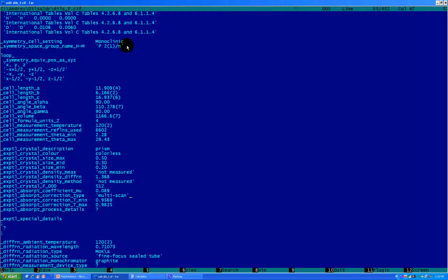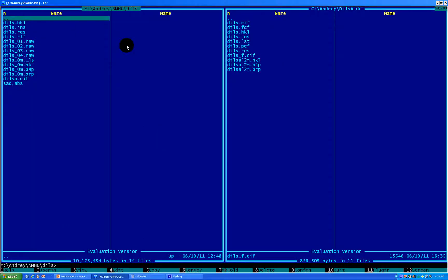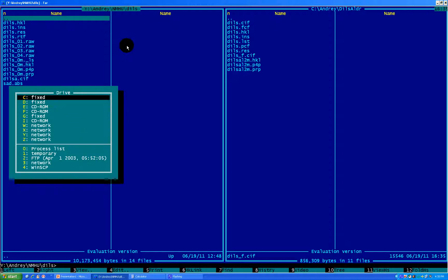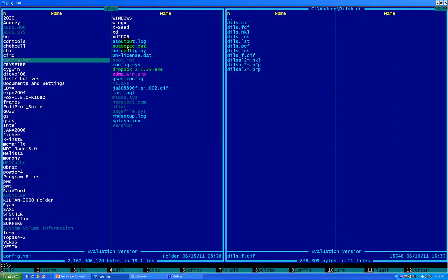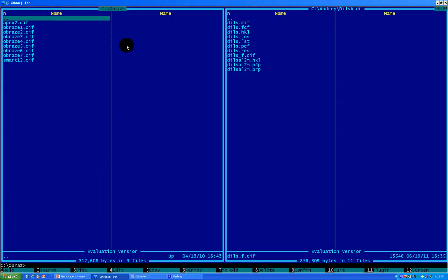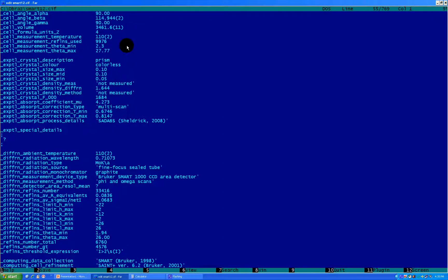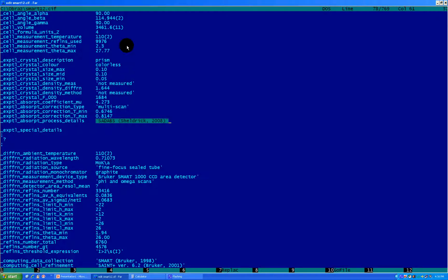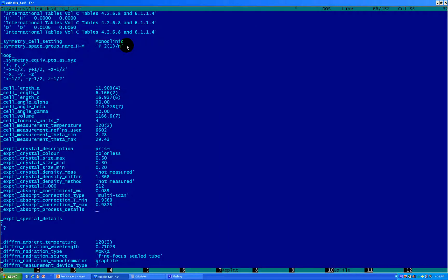Now absorption correction details. And here you would need to introduce references. Well, I usually, what I prefer to do, I usually prepare the example file with all those references, which works pretty good. And I just copy-paste those references. And I will upload on the YouTube or somewhere else, if someone needs those example files, I can show it to you. I can send it to you. So that's how I'm gonna do. Escape, save my file. Let's find those my example file. I think it's on drive C. And here is it.